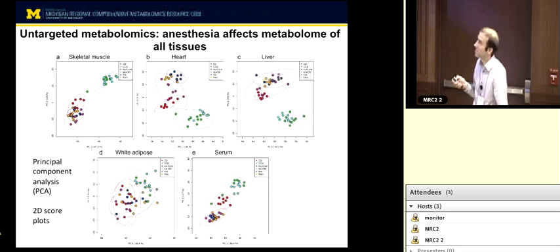The largest distinction that you see is, again, between the modes of anesthesia and the modes of euthanasia. And you can go in and look at individual things that were changed. Some things are increased, are up following euthanasia versus anesthesia. Some things go in the opposite direction. And so let's look at them. So here's just sort of a zoom approach of that. We see many things that are significant, again, highlighting that there are large differences in the glycolytic pathway, pentose phosphate also, the tricarboxylic acid cycle, nucleotides. Things like amino acids were not as dramatically dysregulated, lipids also not as dramatically dysregulated. So the extent of the effects that we observed were dependent on the metabolite classes that we were looking at.